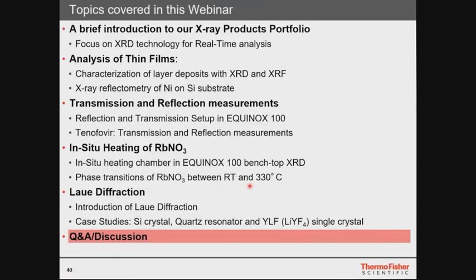The second is for the teaching labs, those students who are going to work with diffraction on a variety of materials for teaching purposes, for learning X-ray diffraction, for data processing of a variety of materials. It's a convenient, easy to use instrument that Simon has walked us through.